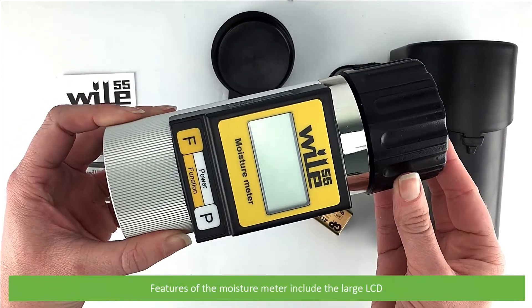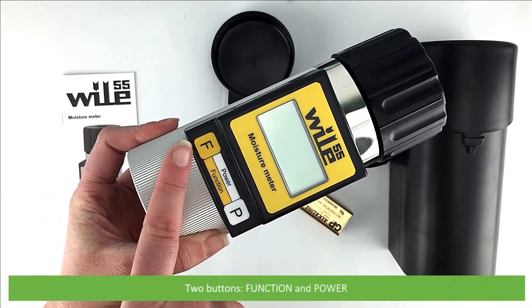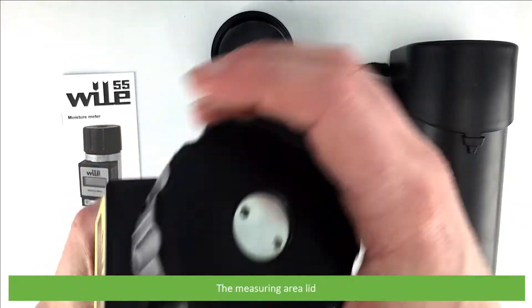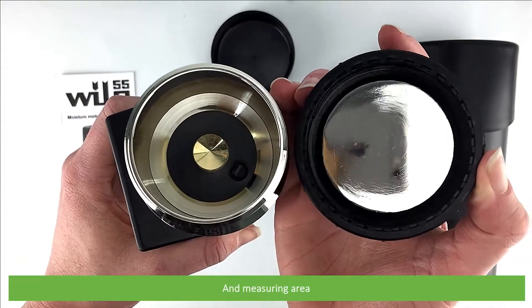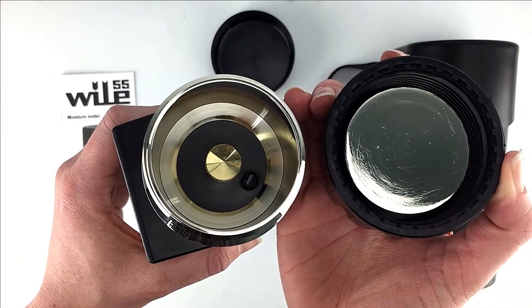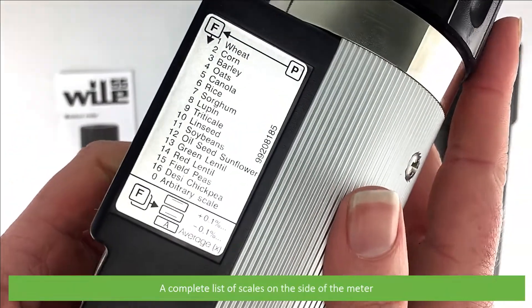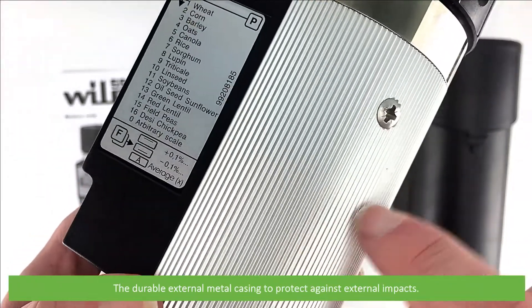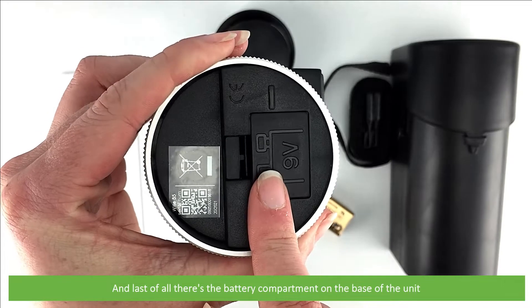Features of the moisture meter include a large LCD, two buttons — these are function and power — the measuring area lid, and the measuring area. There is also a complete list of scales on the side of the meter, a durable external metal casing to protect against external impacts, and the battery compartment on the base of the unit.